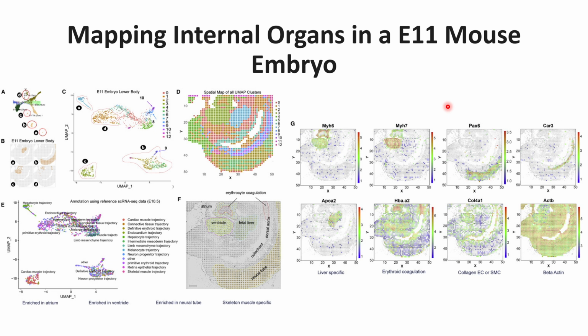So this is about how this DBiT technology can be used to get more insight about the spatial distributions of the cells, and it can even be combined with single cell RNA-seq technologies, and together we can get more insights about the changes that occur within the cells because of the spatial distributions, which can improve our knowledge about biology to a greater extent, and it can help us develop therapies that can be more effective and will be able to cure diseases that are presently incurable.